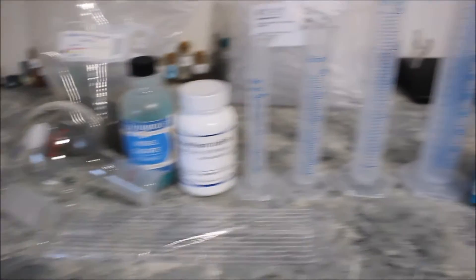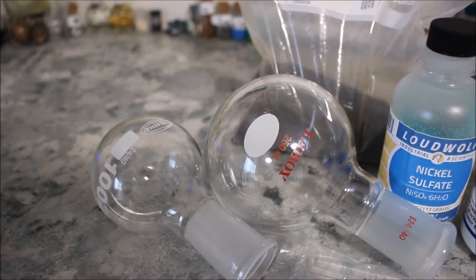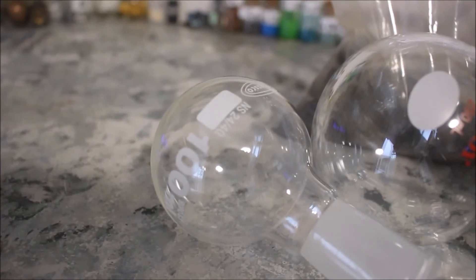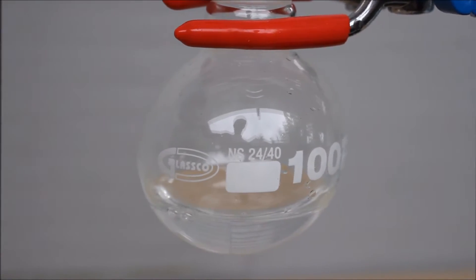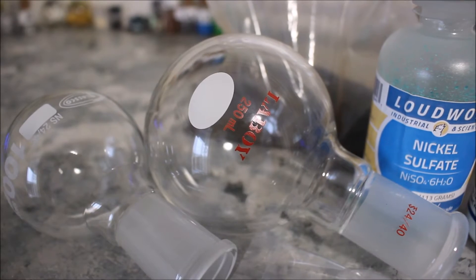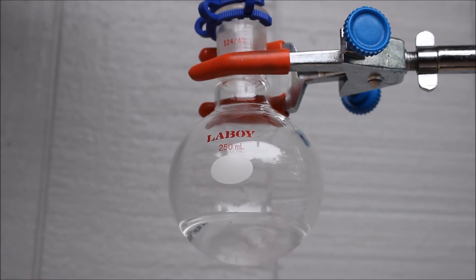Here's my next order — here's a brief glance at it. First up, let's look at the receiving flasks. They're round bottoms, and I'm just going to be using them on the receiving side of any of my distillations. First is a 100 milliliter one — if you want to see that in action, look at the description. Next is a higher quality 250 milliliter Laboy round bottom flask. I also got a few stir rods.